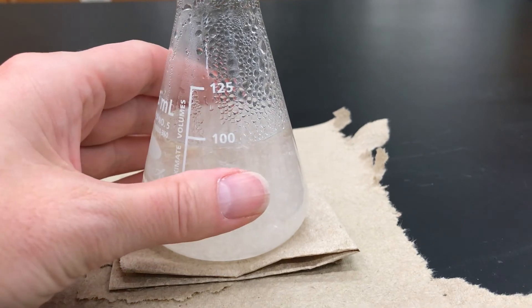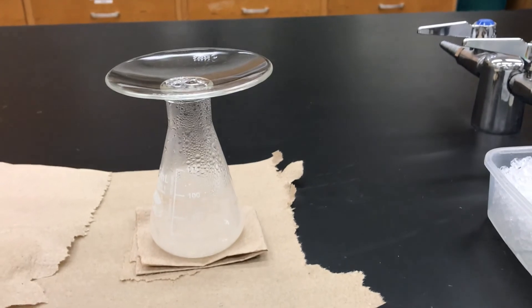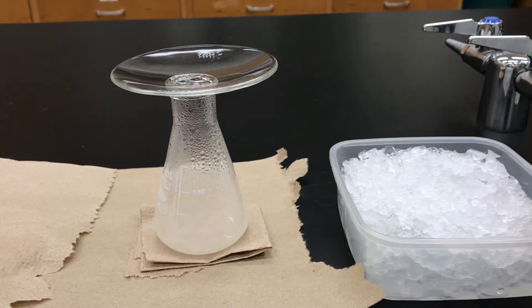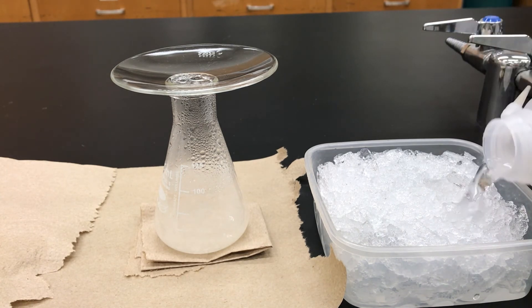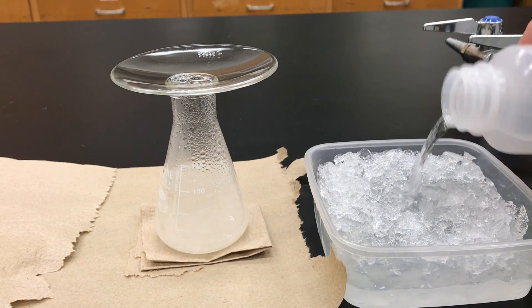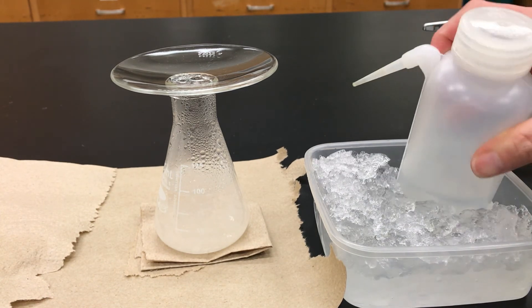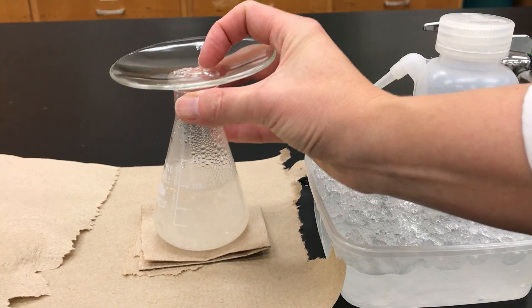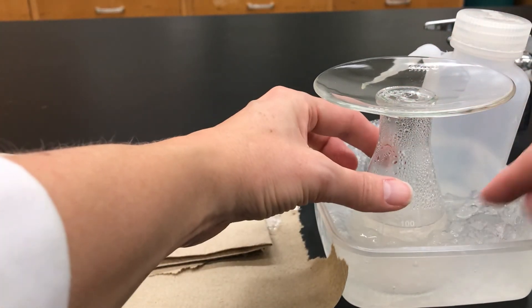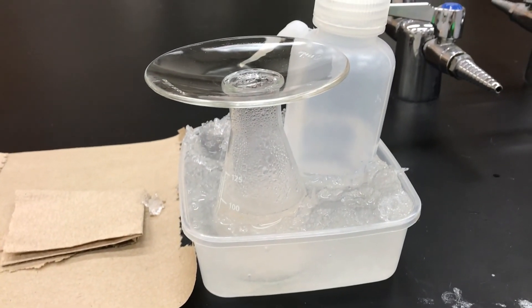Once the mixture has come to room temperature, you want to further the crystallization by putting it in an ice bath. Get a bucket of ice and add some water to it — you want to have an ice and water slurry. If later you're going to do a rinse, then you can put some of your rinse solvent, in this case water, inside the ice bath. Most importantly, put your solution in the ice bath and let it sit there at least five minutes. Then what you would do next is recover the solid using suction filtration.